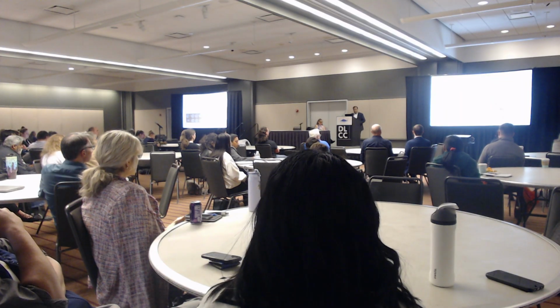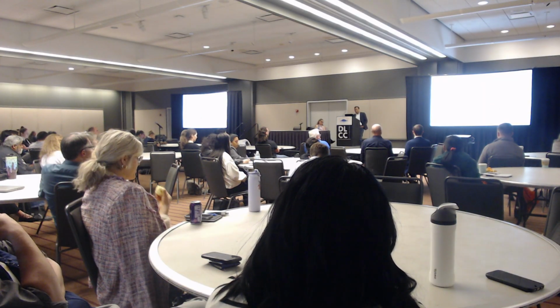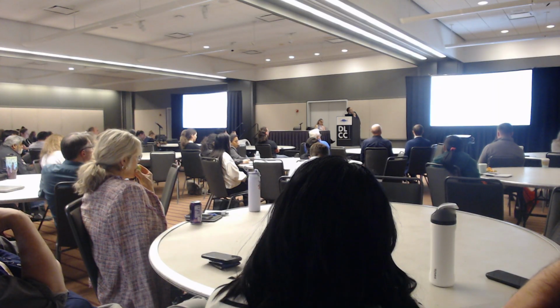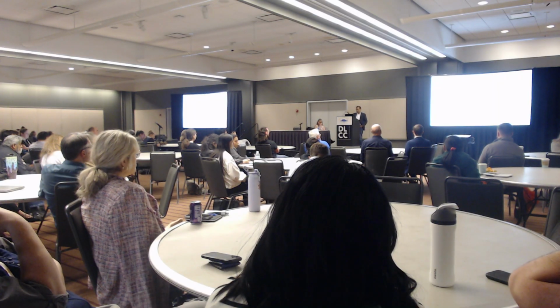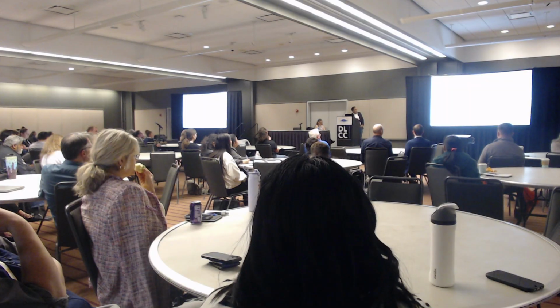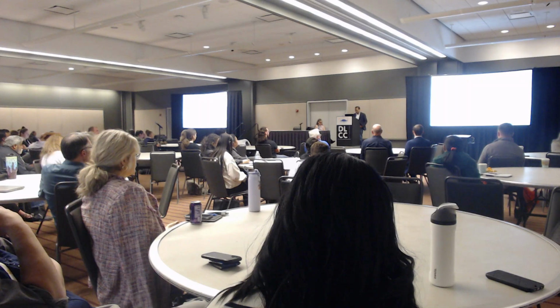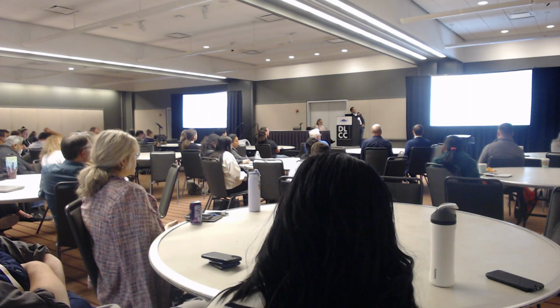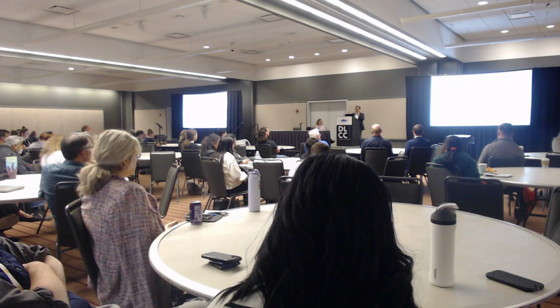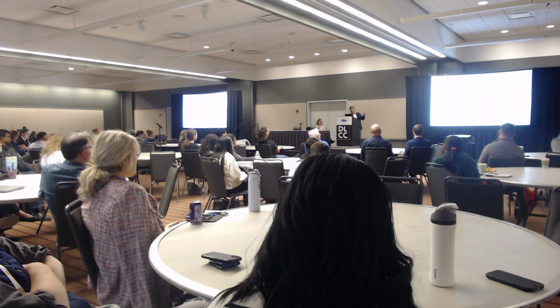We partnered with one of our colleagues at the Cell Therapy Institute, Dr. Rizwani's team, and I'm going to show you a very simple, crude version of the images we took. Yanxiang showed brain as the positive control for Atlas Xomics, but we had this test sample from Dr. Rizwani's team. They were trying to find out if NK cells would invade these tissues. These lines just show how that clamping system made life easier, because by following those lines on the microscope, we could see that all those barcodes got properly stamped into the tissue section.